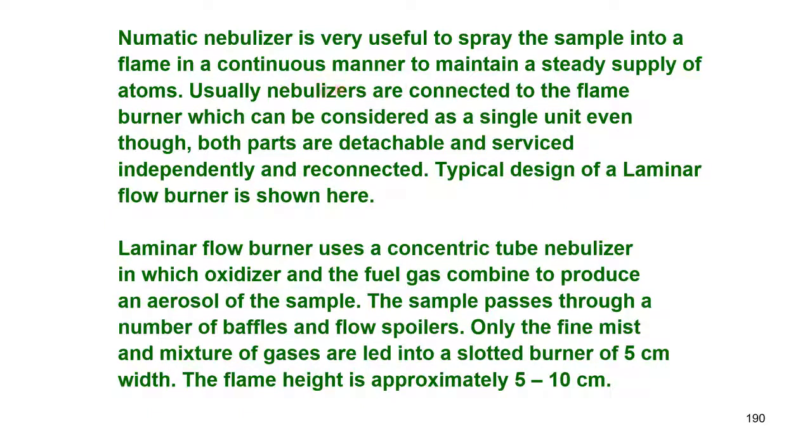So, usually, look at this slide now. Nebulizers: the job is to spray in a continuous manner. Look at the slide. I want you to understand this. A continuous manner to maintain a steady supply of atoms is a must. Usually they are connected to the flame burner through a small capillary, which can be considered as a single unit, even though both parts are detachable and serviced independently and reconnected.